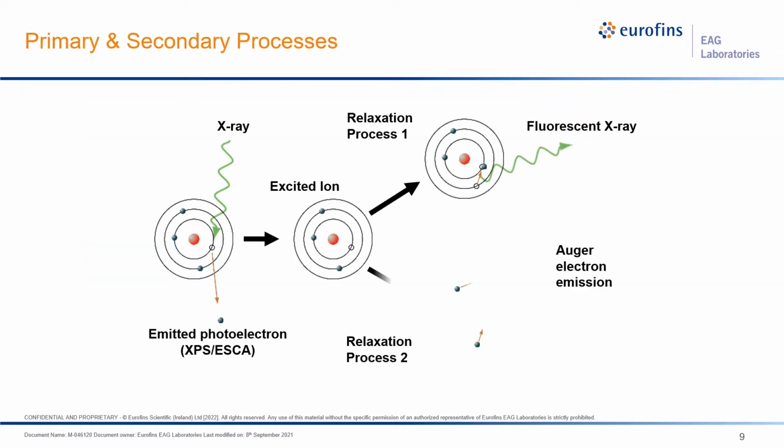So what is X-ray fluorescence? This diagram, which demonstrates the fluorescence process, is one you may have seen before if you tuned into our XPS seminar. While in XPS, the primary radiation is a low energy X-ray, such as the aluminum K alpha line at just under 1500 eV, the principal interaction of X-rays with matter still applies.